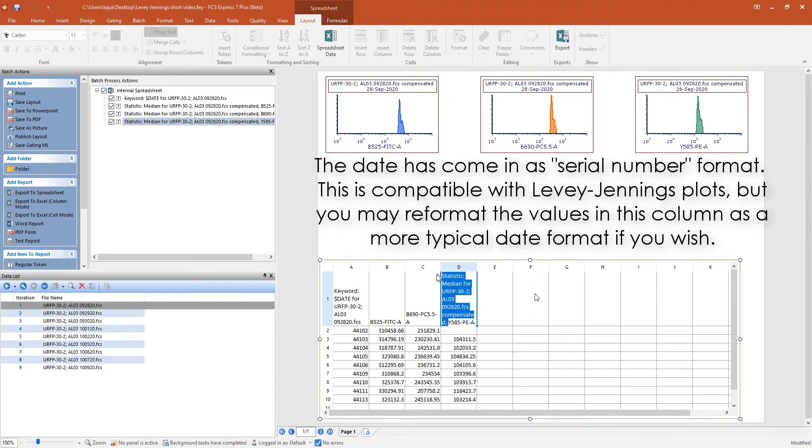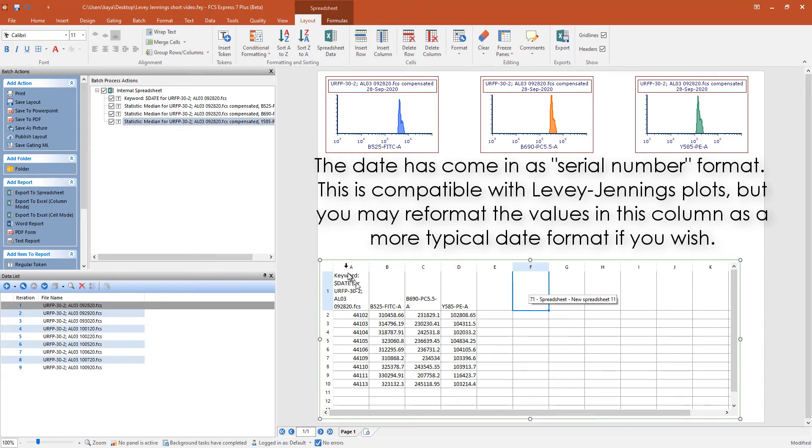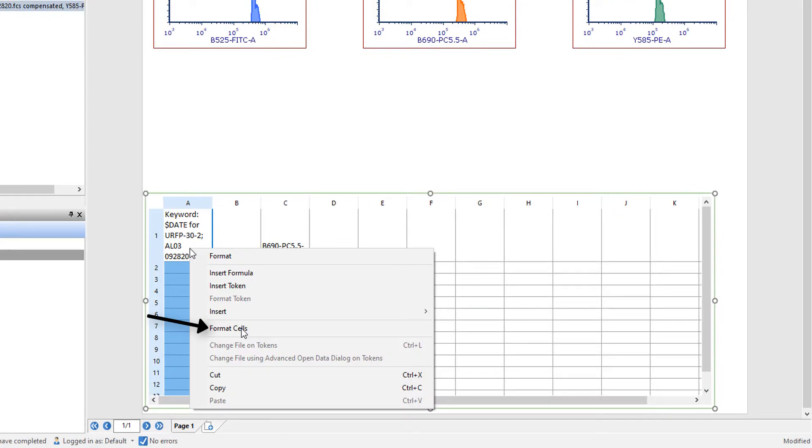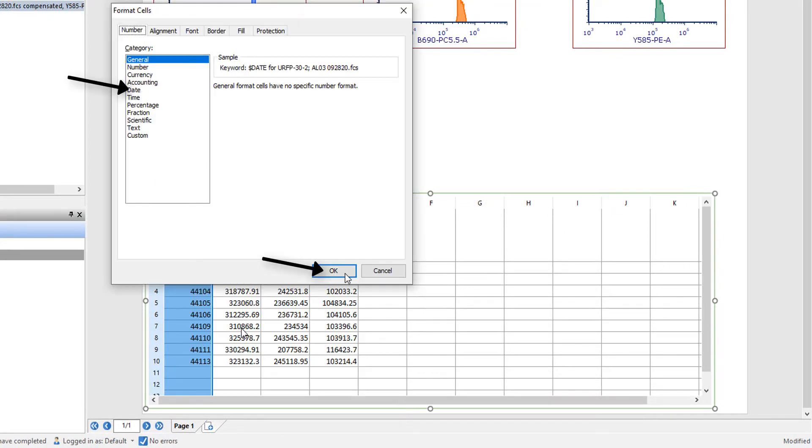Depending on your cytometer, the date might come in as a serial number. If this bothers you, you can highlight the entire column, right-click, and format the cells as Date.